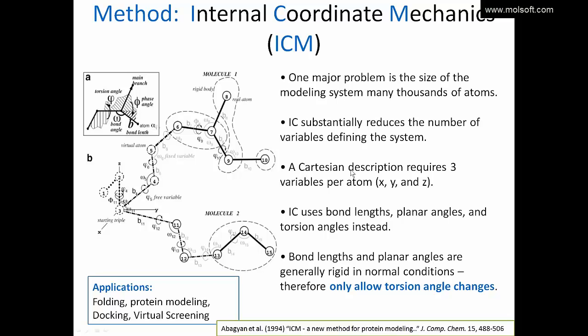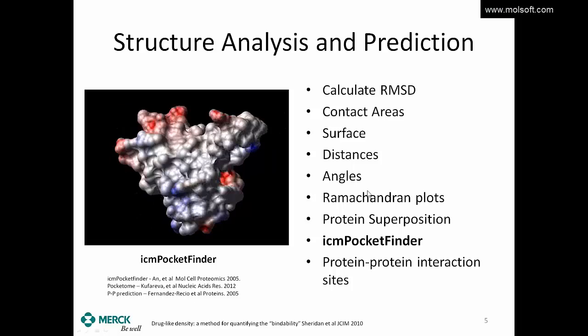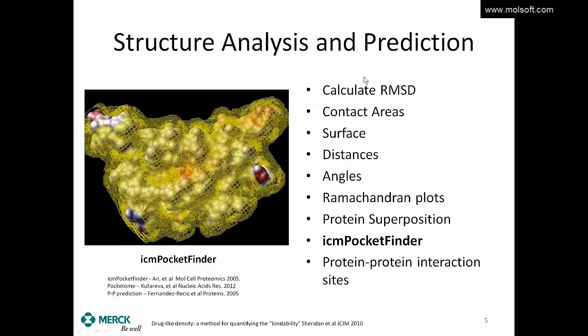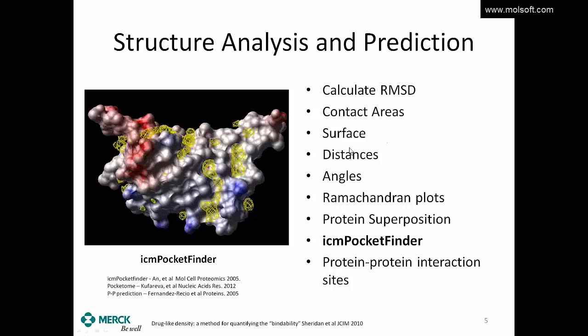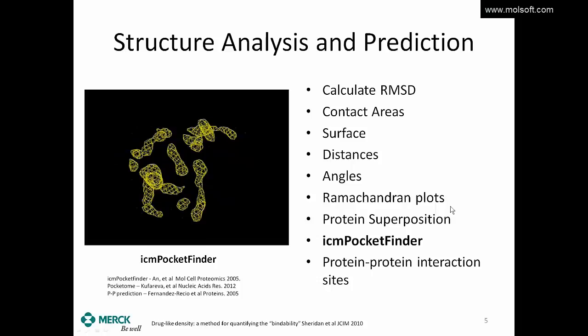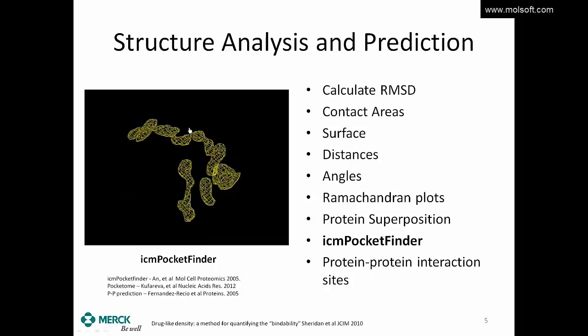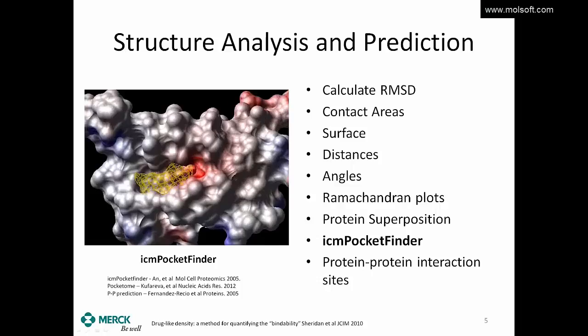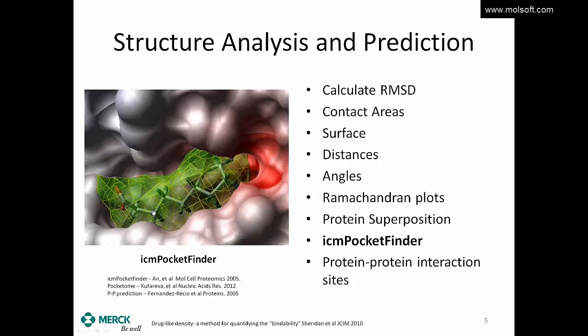Our first example is looking at structure analysis and prediction. We're going to read in a kinase and look at the RMSD difference between the APO and holo form. We're going to look at contact areas, some distances and angles, and we can generate a Ramachandran plot. We'll also look at protein superposition and ICM pocket finder. ICM pocket finder basically takes the protein, rolls a probe across the surface, and contours any cavities found. We find a number of cavities and have a way of eliminating non-drug-like ones based on size.